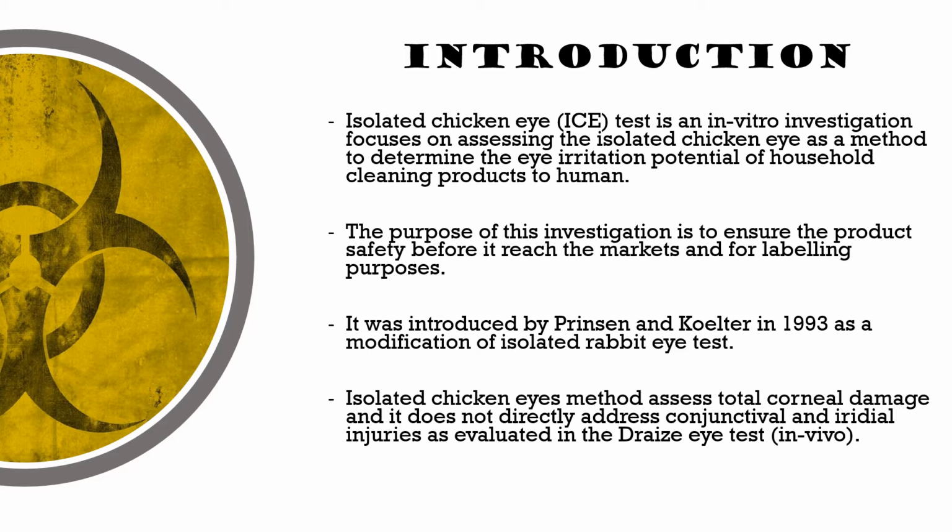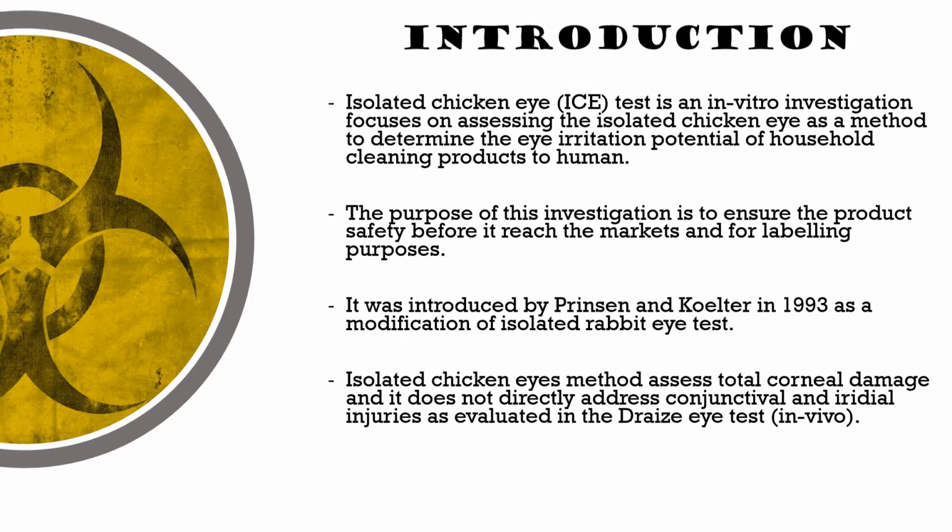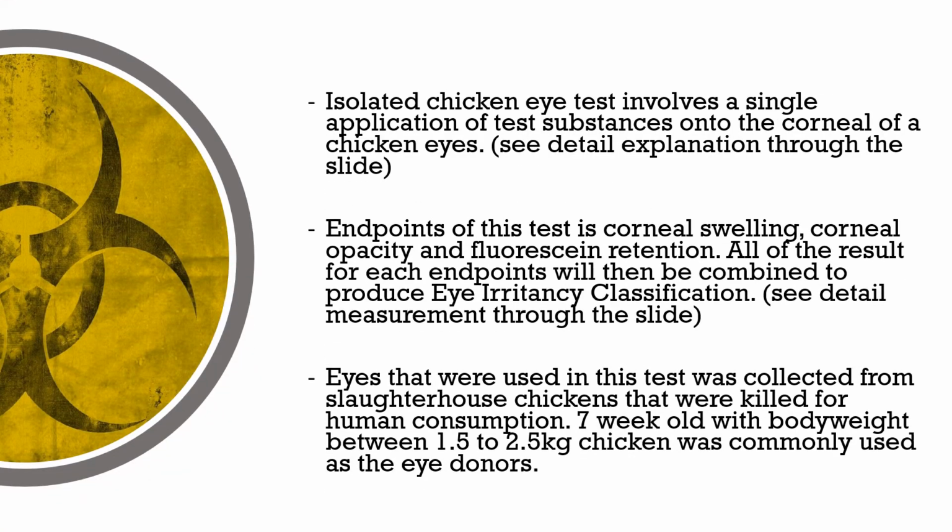This test was introduced in 1993 as a modification of the isolated rabbit eye test. It assessed the corneal damage and not conjunctival and iridial injuries as evaluated in Draize's eye test. Isolated chicken eye test involves a single application of test substances onto the cornea of chicken eyes. The endpoints of this test are corneal swelling, corneal opacity, and fluorescein retention. Isolated chicken eye test is basically an animal-cruelty-free method.